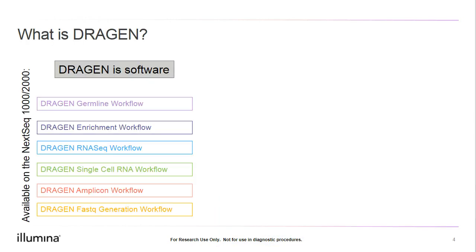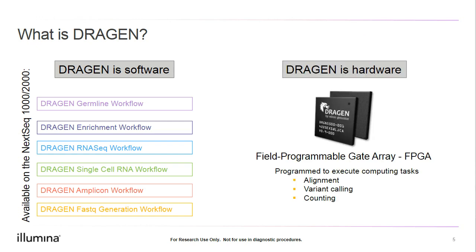So what is DRAGEN? DRAGEN is software. DRAGEN contains several workflows on the NextSeq 2K, including all of the workflows here. And DRAGEN is also hardware.